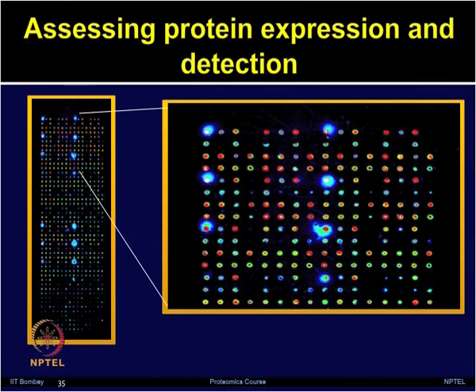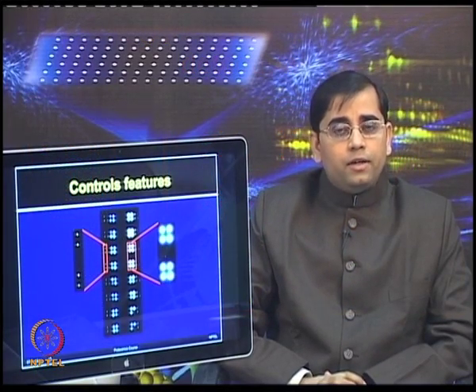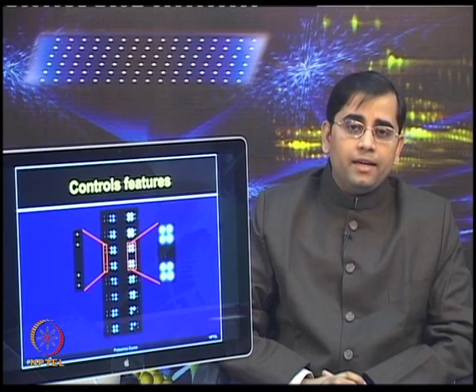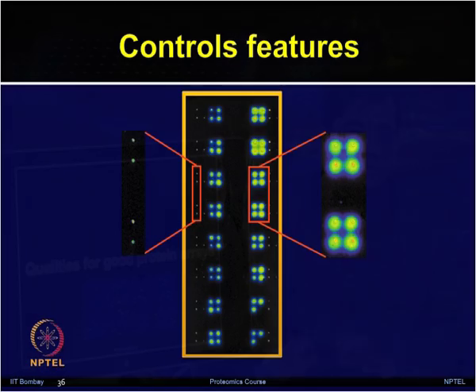It can also be used for statistical analysis later on by the biostatistician, so that different protein expression can be normalized. Another control feature and QC check shown on the slide: the same gene printed 4 times in repeated blocks, and then negative controls are used to give an idea of the background.